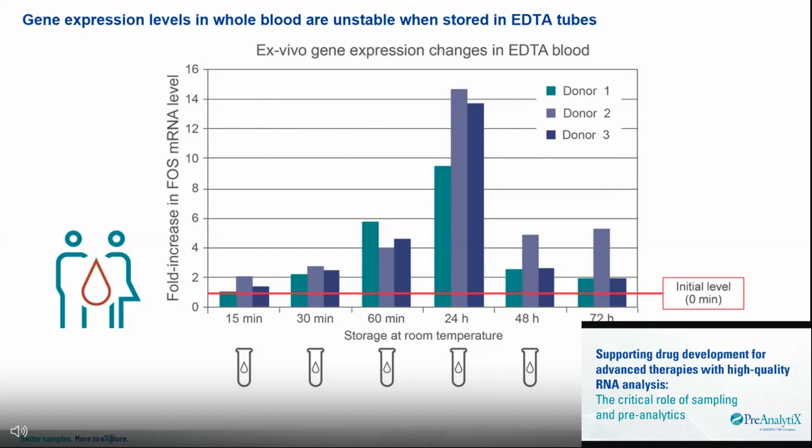Changes are the results of two main principles. First of all, the vital cells come from a living organism, and they are transferred to a collection device, which has a total artificial environment. Cells come into contact with glass, plastic, rubber, the oxygen, nutrition supply is different, temperature decreases, and for the cells this is a crisis, and they react to this situation in this artificial environment quite fast.